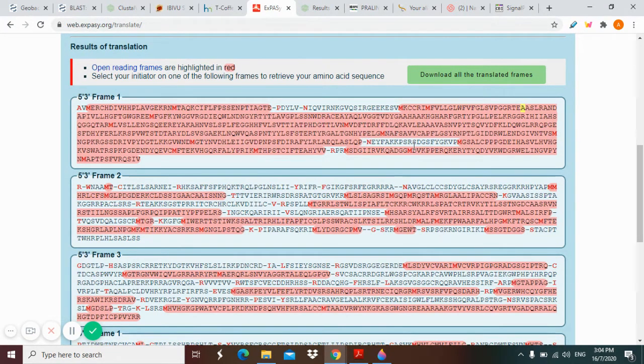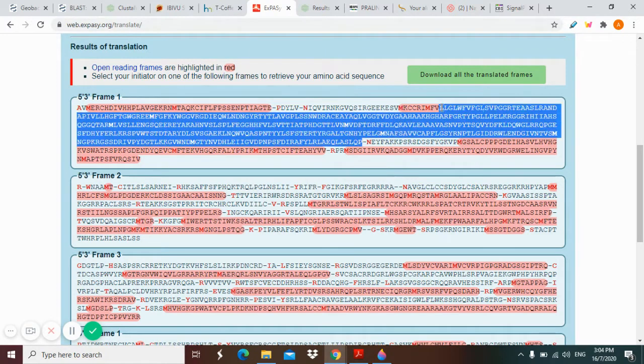Okay, and since I've already calculated, the gene started from the one that I highlighted here, which is A at the 28th amino acid. So here into here. So we will copy this. So this is what you call the mature lipase gene. And this mature lipase gene will be pasted on this protein blast.